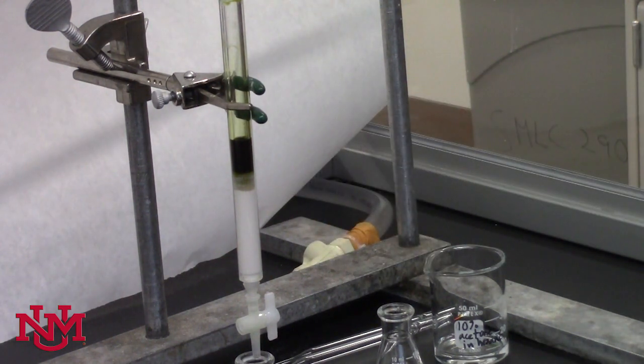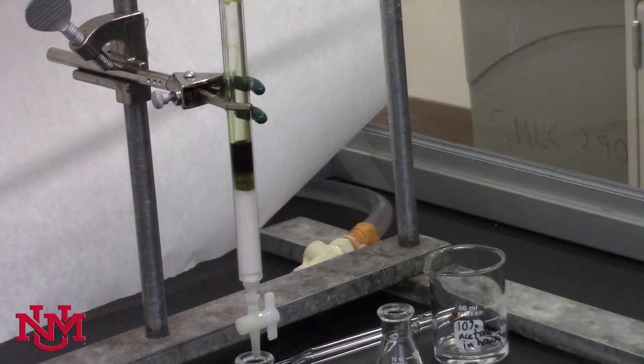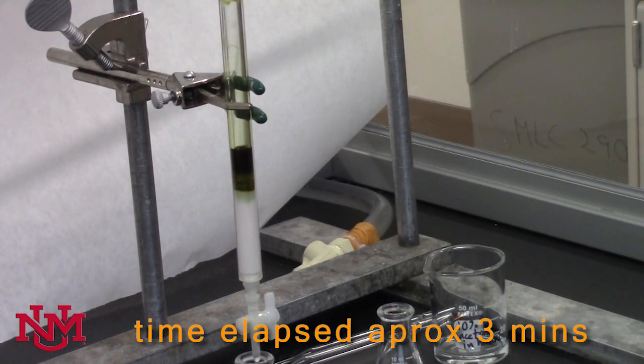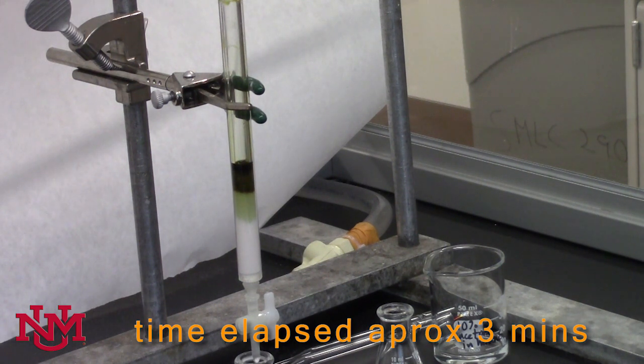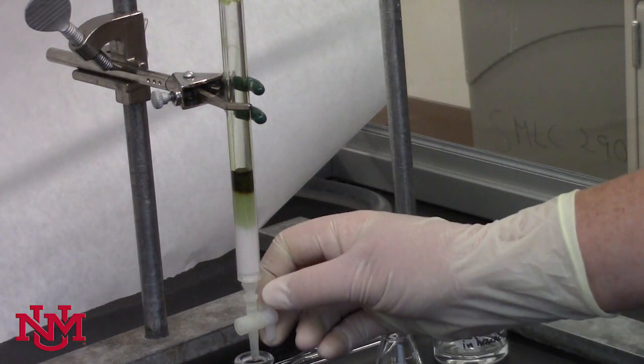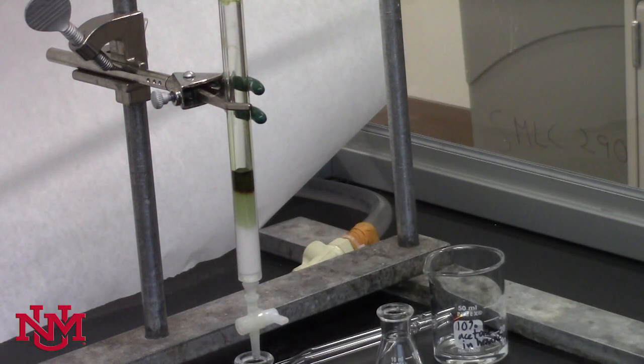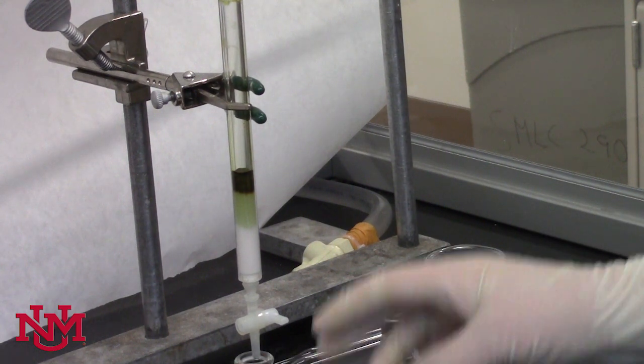Now we'll open the stopcock and continue to drain the solvent level so that the top of the green is again even with the sand. You'll see the sand start to turn green, as well as the alumina once the spinach extract reaches that. At some point it's going to stop moving and stay stuck sort of at the top of the column. That's about an appropriate solvent level. At this point, you would add a little bit more hexane.